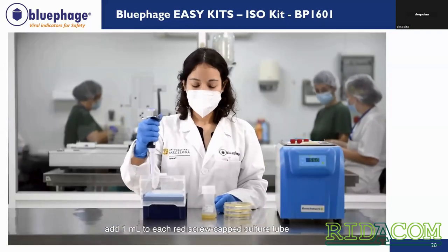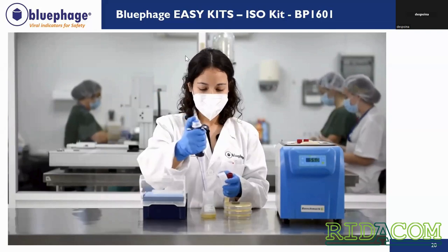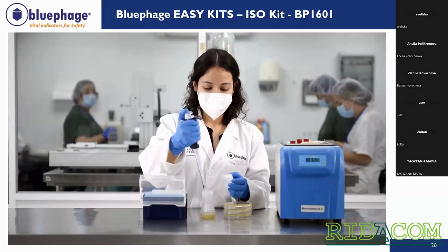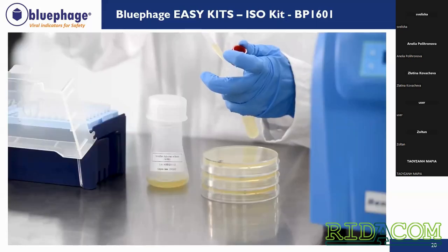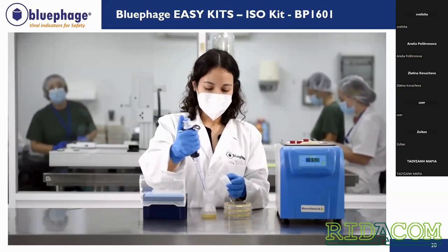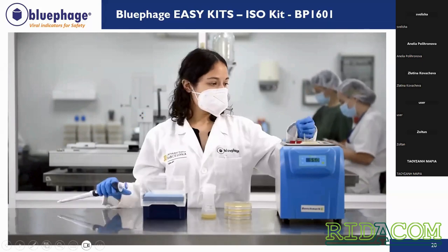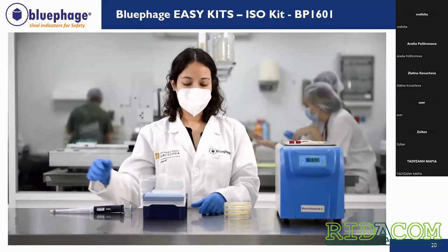So now we have the E. coli culture ready to be used. So we will add 1 mil of E. coli culture in each test tube. Once that is added, we will mix it. You will see once that she distributes the mix in each test tube. So now we will mix our test tube carefully.